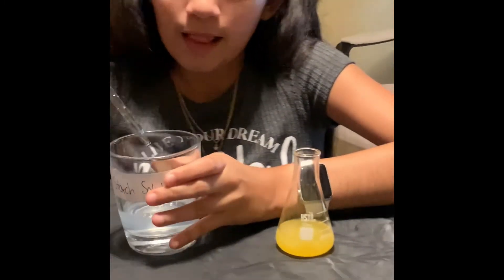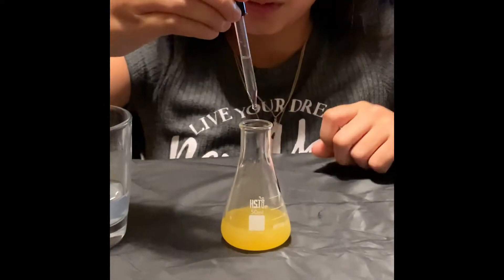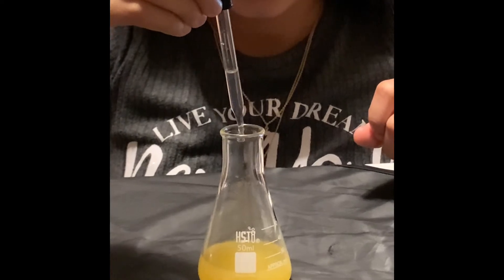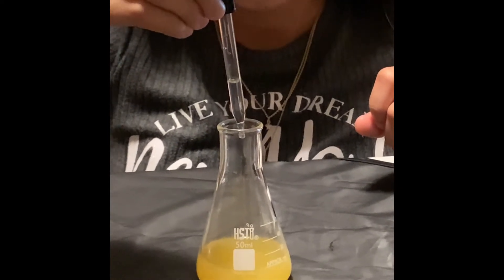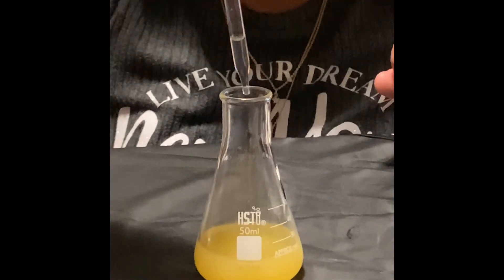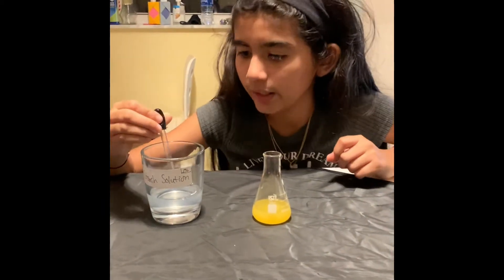So now I will pour 10 drops of starch solution into our juice. 1, 2, 3, 4, 5, 6, 7, 8, 9, 10. And the rest I will just put back into my cup.